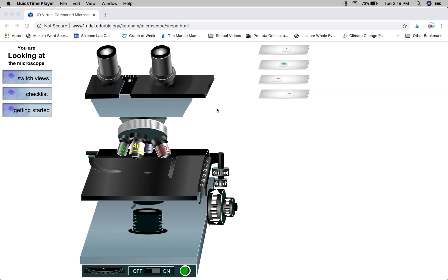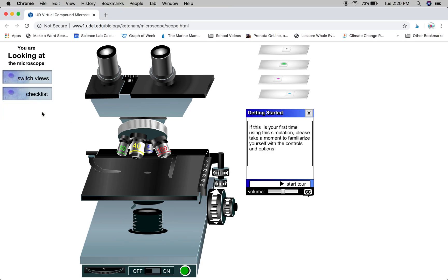The tutorial for an online virtual microscope. If this is your first time using the website, it's a good idea to click on getting started and go through the tour to see all the parts of the microscope and how they work.